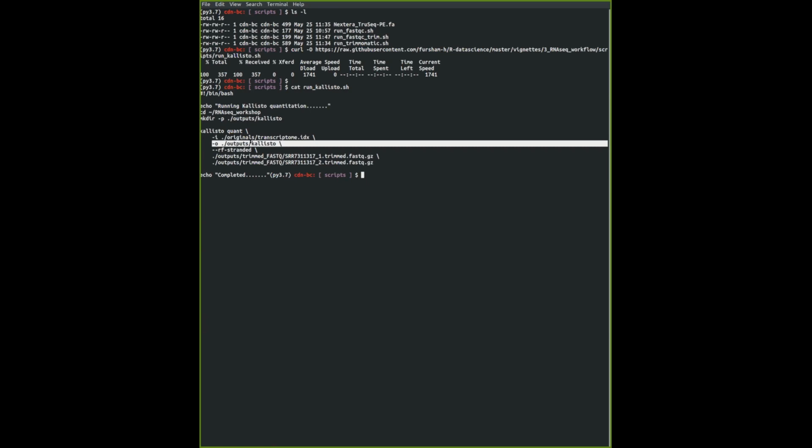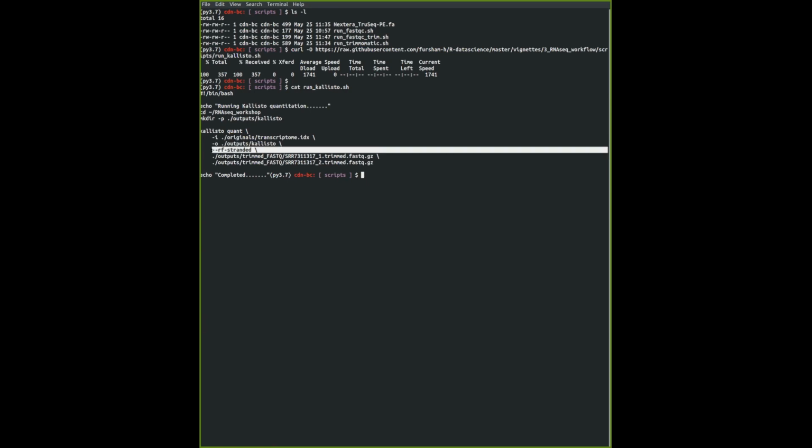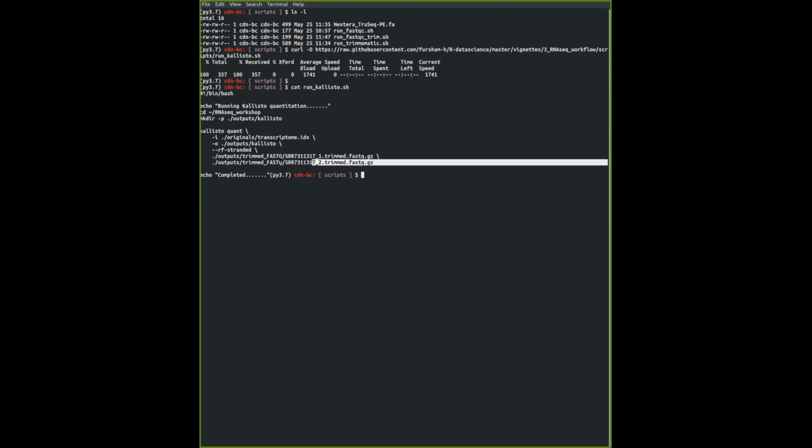the output file. As I've shown you, this is the stranded option that we're going to go with, because this is how the files are actually oriented. And then last but not least, the 2 FastQ files as an input. All right, a very, very simple set of code. Let's run this. Again, it's not going to take too long.